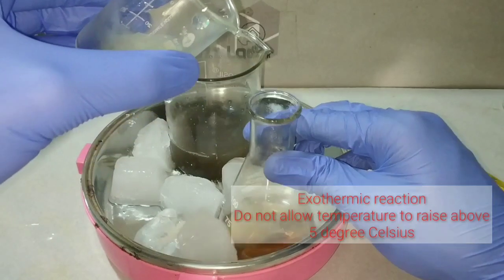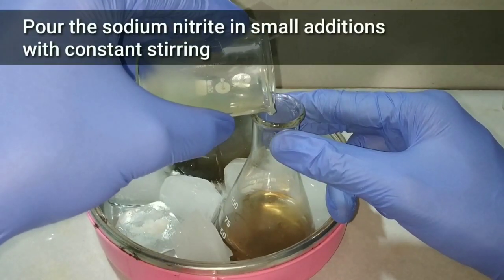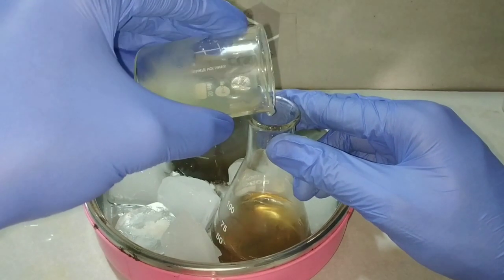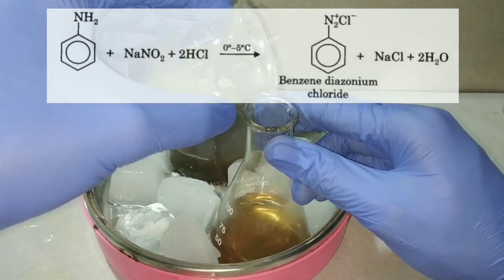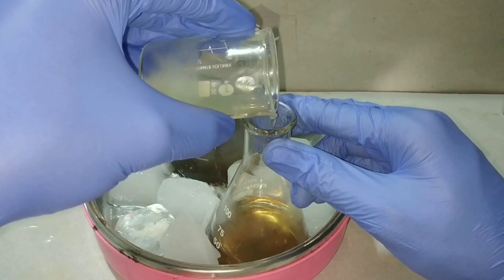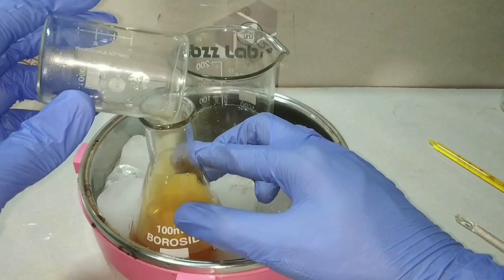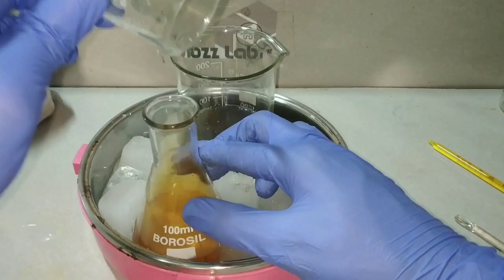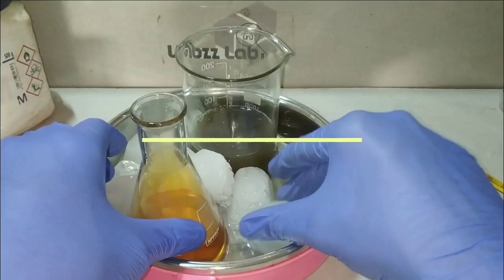First, we add the cold sodium nitrite solution into the aniline-hydrochloric acid mixture in small additions with constant stirring, because this reaction is exothermic and care should be taken that the temperature does not go above 5 degrees Celsius. Here the aniline is reacting with sodium nitrite and hydrochloric acid at 0 to 5 degrees Celsius to form benzene diazonium chloride.